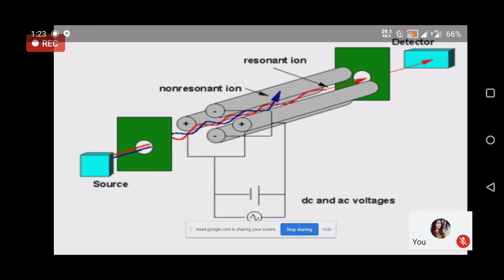Yes, correct. Because one m/z is able to reach the collector electrode by moving through the channel undeflected, and that is possible for that m/z because of the conditions that you are applying. You are applying potential to the four electrodes, or the two pairs of electrodes.